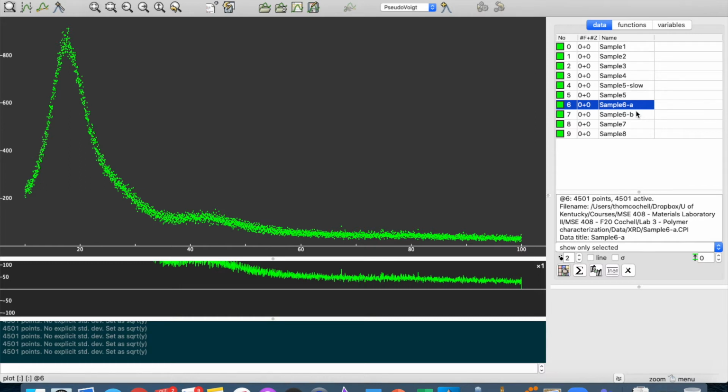If we just look at this, there's not much of a pattern going on. There's this really wide peak here, and we don't see much in the signal other than this very wide pattern, which, if you go back to some of the metal patterns, you might have even seen something similar.